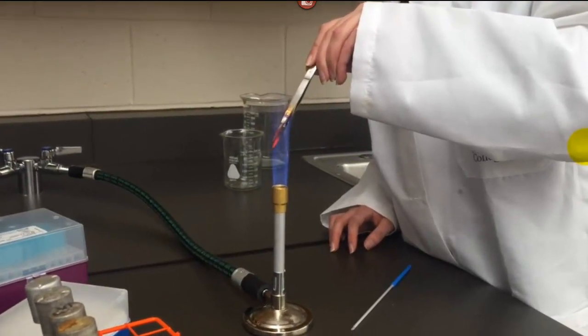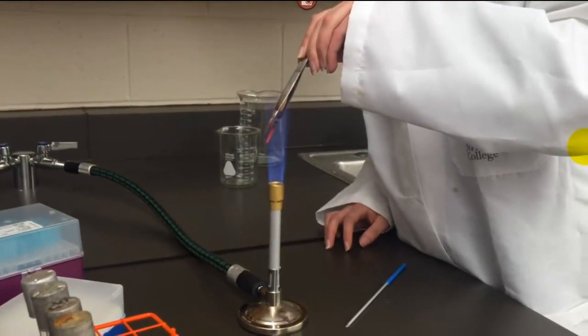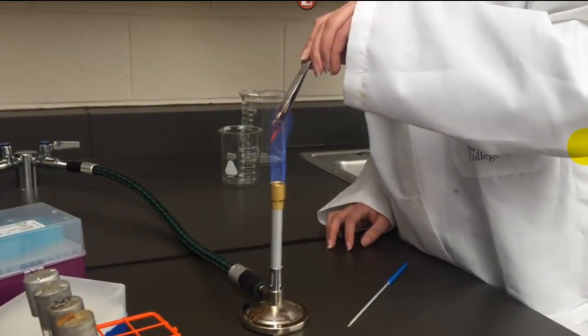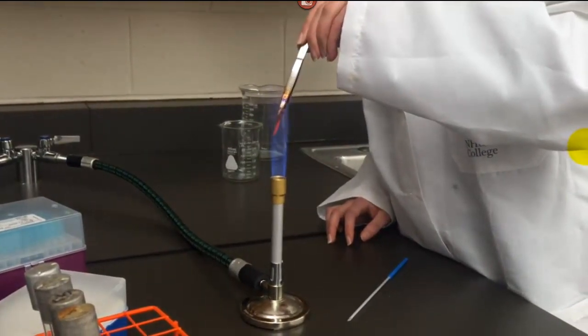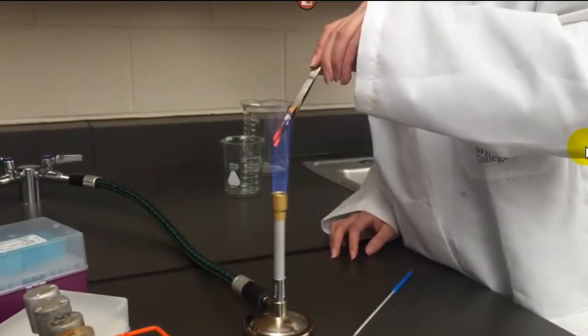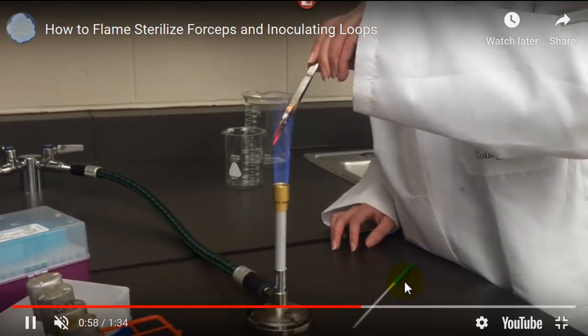Dry heat and flaming is probably the most efficient way to sterilize something. The problem is that not many things can handle that type of temperature. And she's definitely got these sterile. Now, I'm waiting for her to pick up this agar slant on the bottom.